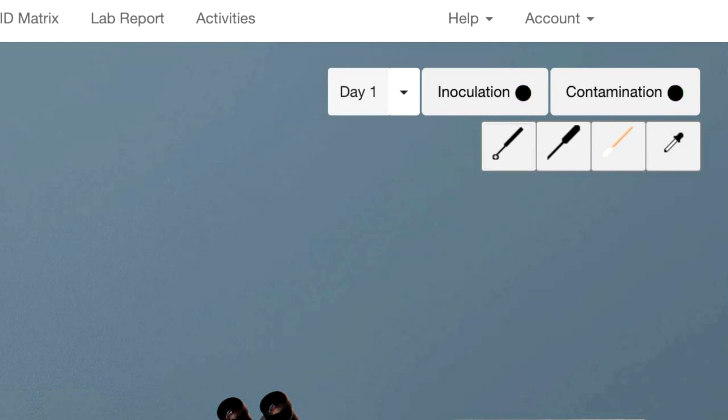Finally, you will see various lab tools: a dropper for adding reagents and stains, an inoculating loop, an inoculating wire, and a sterile cotton-tipped applicator or swab.